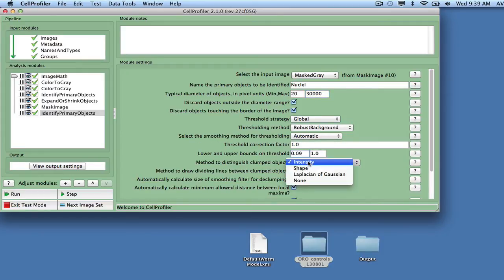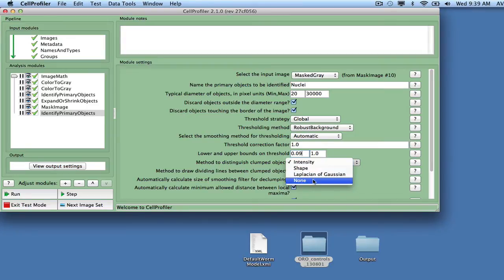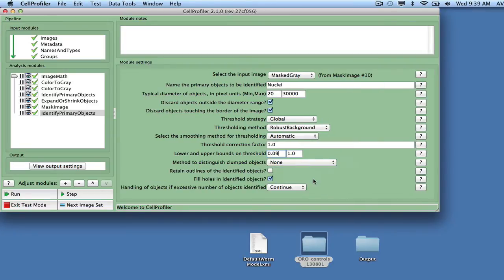In this case, we will not attempt to separate touching objects. Uncheck the Fill Holes in Identified Objects setting. Finally, we will give the name Worm Objects to the Worm Objects.